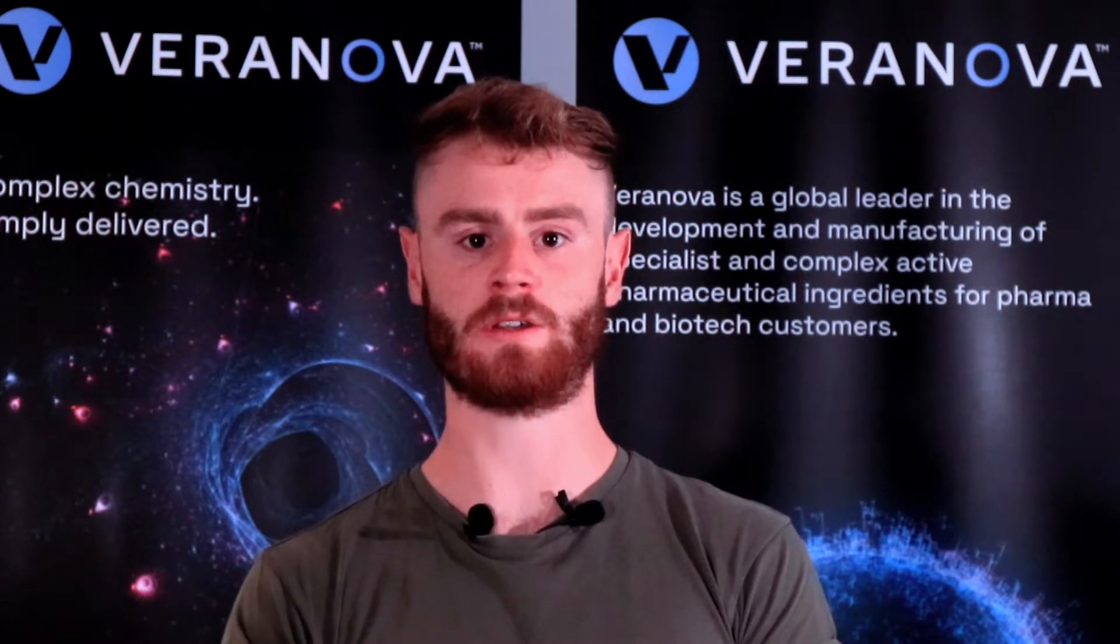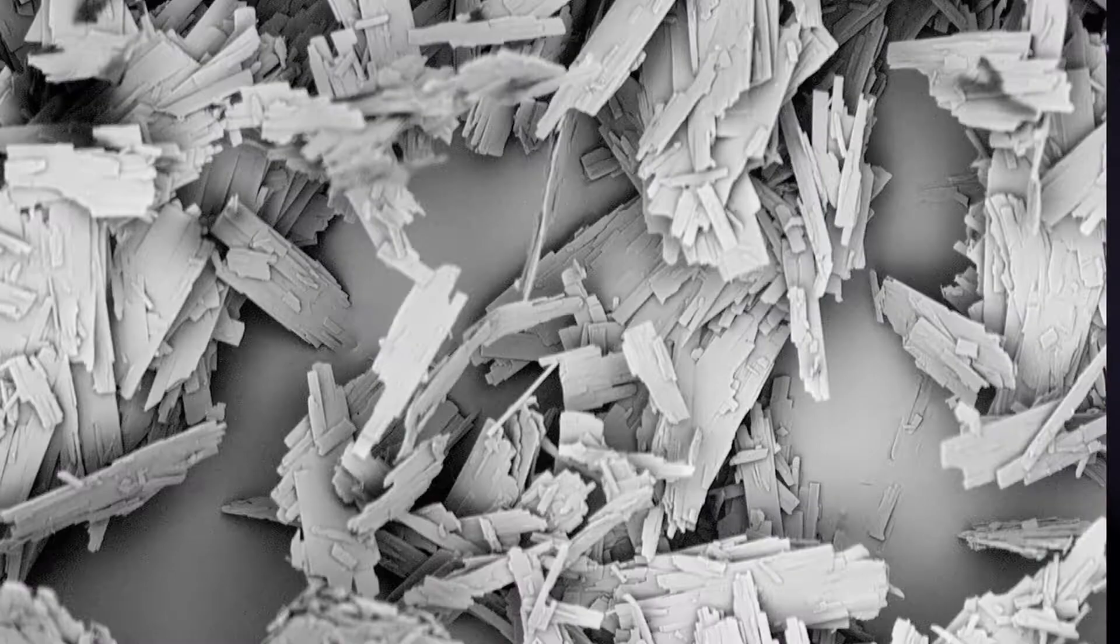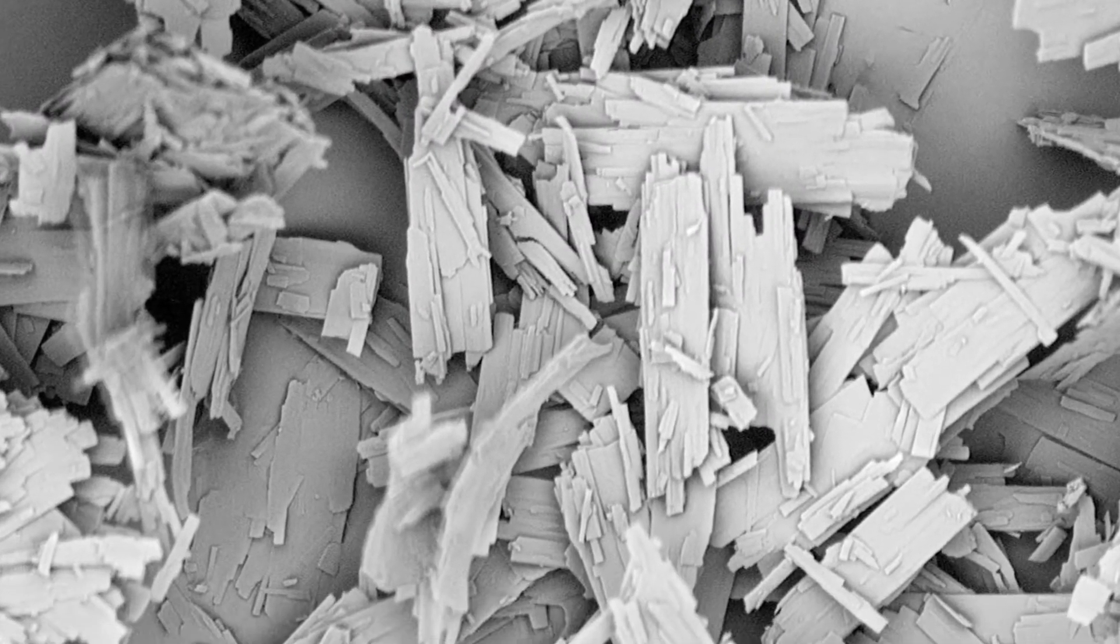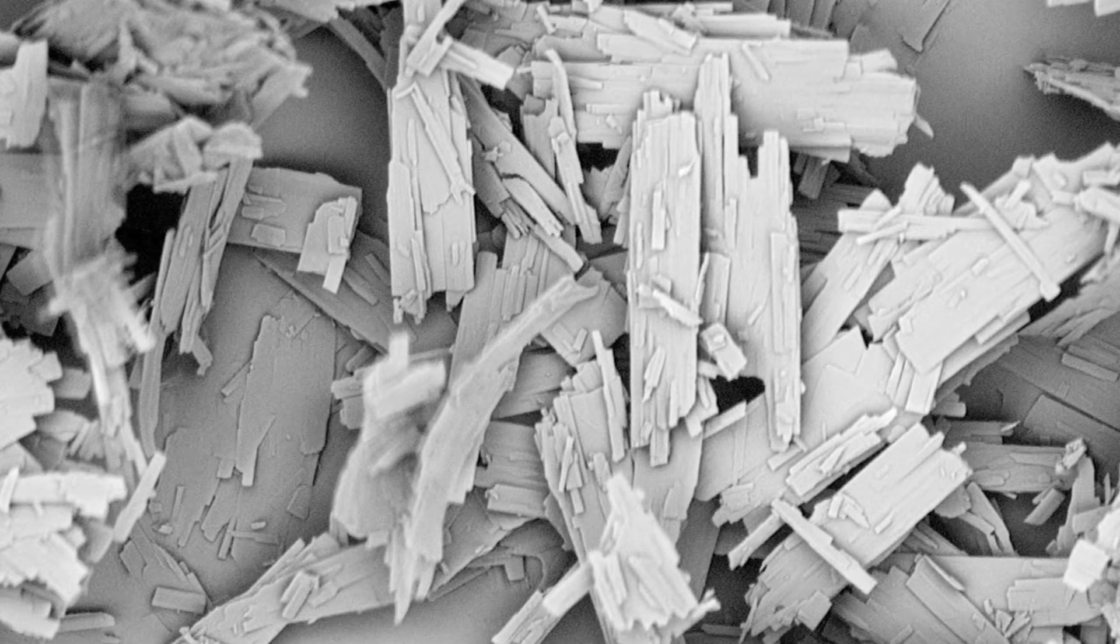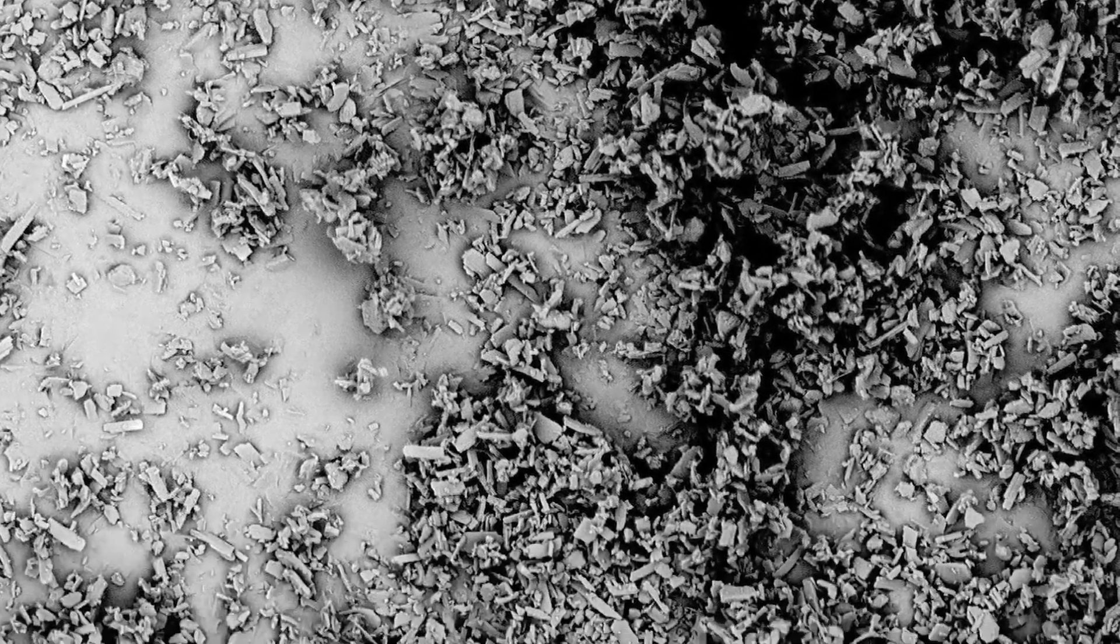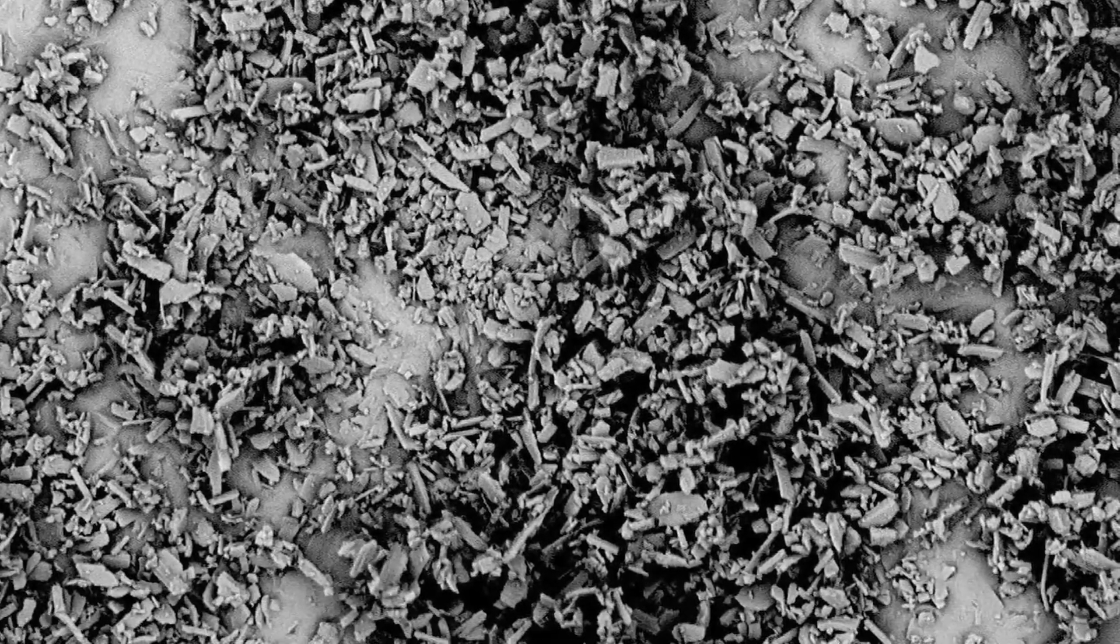This is used for micronisation as part of our expanded particle engineering offering. Jet milling is a powerful technique typically used to reduce particle size to between 5 and 15 microns. The material is fed into a chamber where high-pressure nitrogen jets cause collisions between particles.